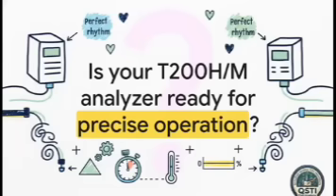By strictly following these precise steps, respecting the physical flow of the pneumatic connections, locking in the exact span concentrations, correctly assigning the stability gas, and, maybe most importantly, having the patience to wait for that 0.1% stability, you completely eliminate the guesswork. Your instrument's offset and slope values are now perfectly mapped to physical reality, but it really leaves you to wonder, if being just a fraction of a percent off in calibration can totally skew an entire facility's emissions data, what other instruments in your network might be quietly drifting off baseline right now? Definitely something to think about.